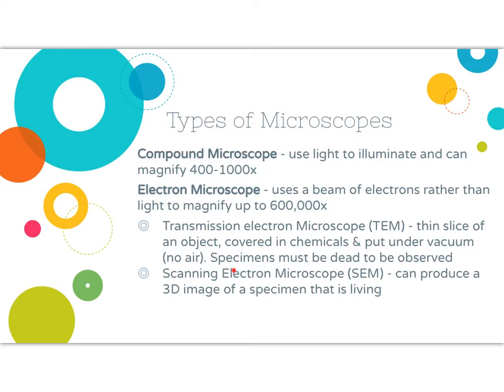This must mean then that the specimen is dead. So the specimen is what we're looking at because we've sliced it up, we've coated it in all kinds of chemicals, and we've given it zero air. Okay, so dead things look good under a transmission electron microscope.